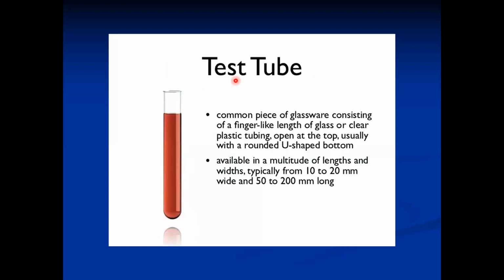Then this is the test tube, which is the commonest glassware in the lab. It is used to hold liquid, and it is basically used to heat the liquid or to warm the liquid.